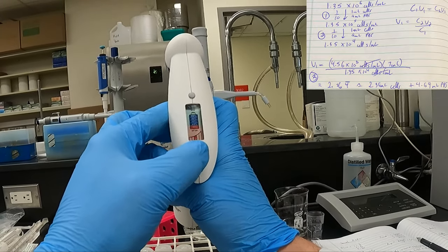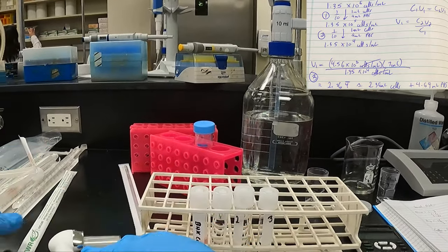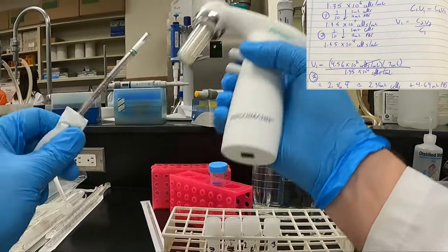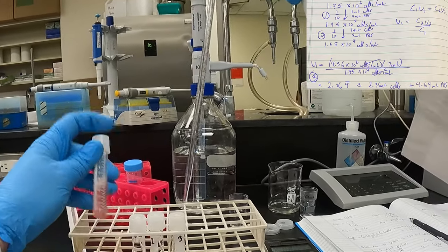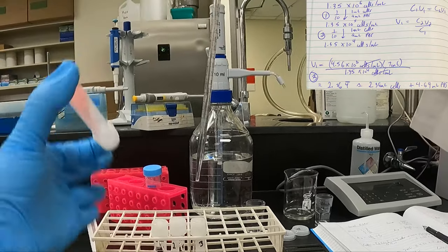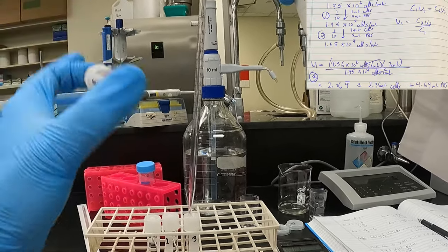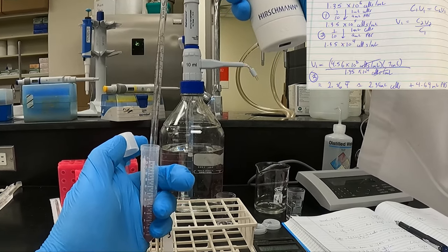I'm going to lower the speed on my pipette controller, as I'm going to be using a 2 mil pipette for this. The diameter is very small, so the fluid moves up and down very quickly. That's why I reduce the speed of my pipette controller. I take my initial sample of cells, make sure it's thoroughly mixed. I'm going to take 1 mil. Make sure you take your time with this.